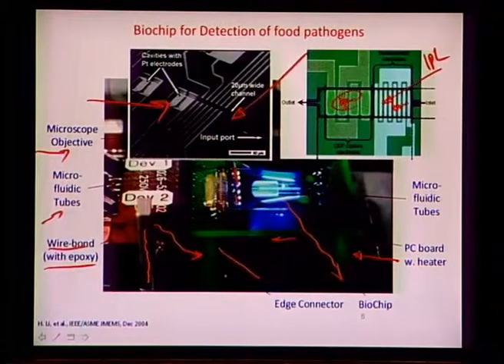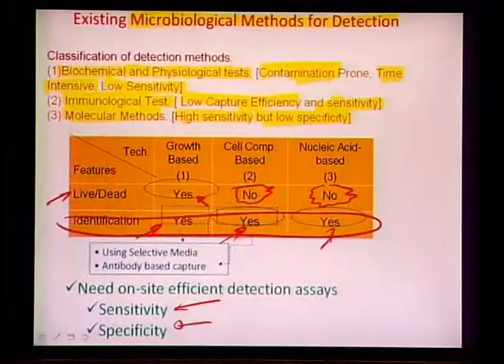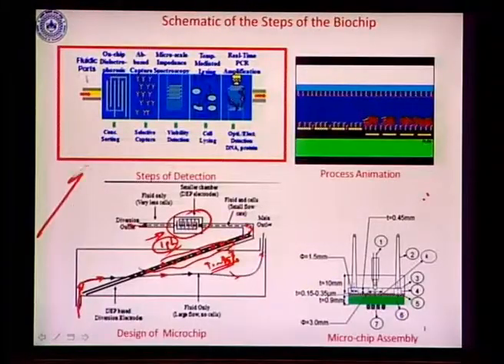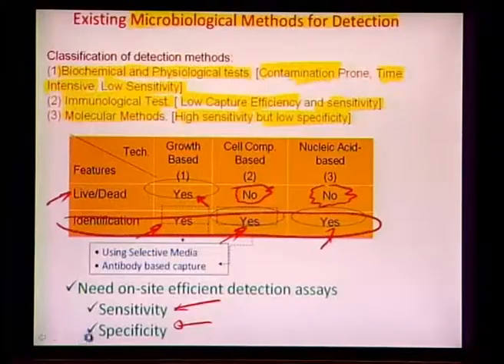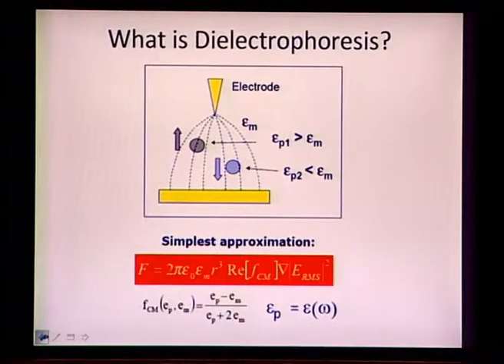So, essentially this in a nutshell can do all these other jobs that were shown just a minute back in this particular slide, okay. Now, let us understand one by one the different principles. The first principle that this biochip uses is dielectrophoresis. Now, what really is dielectrophoresis?